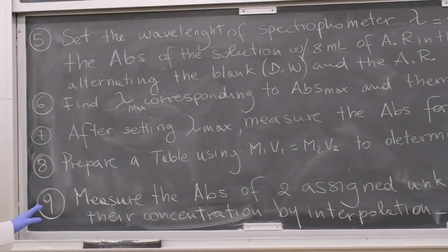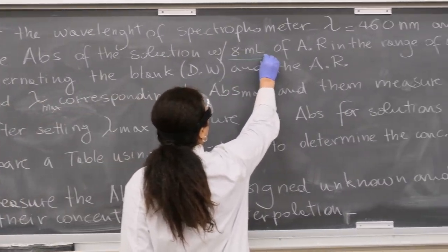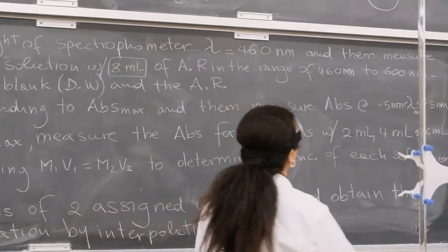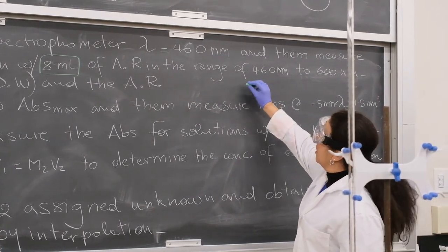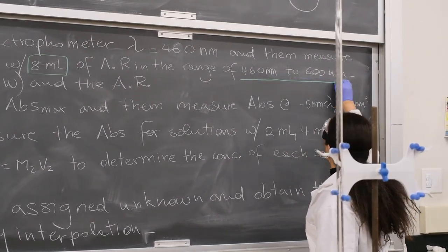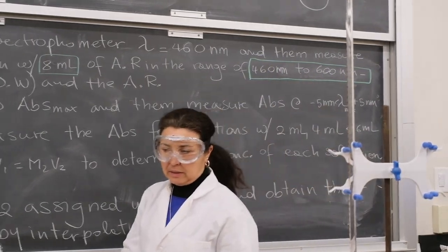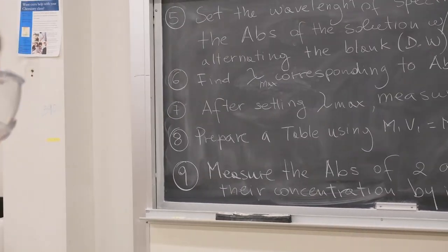The first thing that you're going to do is use the 8 milliliter solution, the one in which you put 8 milliliters of Allura Red, to determine the absorbance of the solution between 460 and 600 nanometers wavelength. So let's see how we do that.